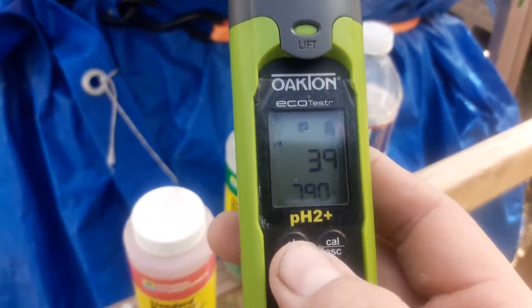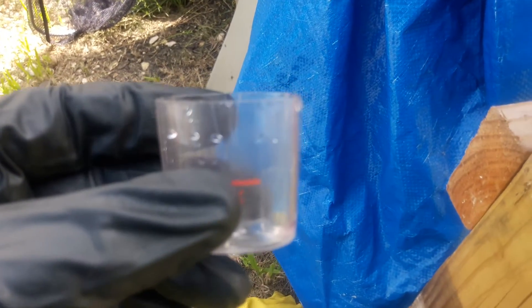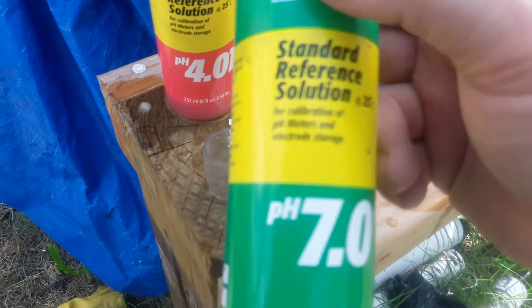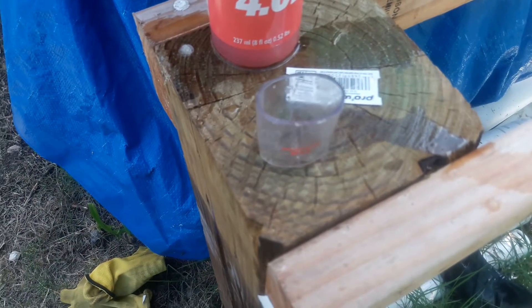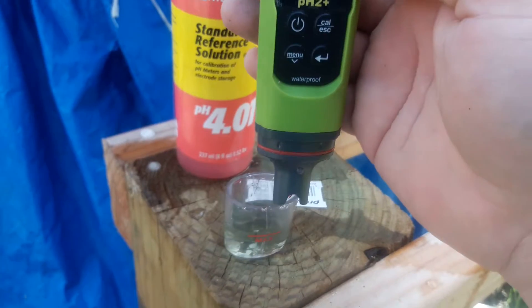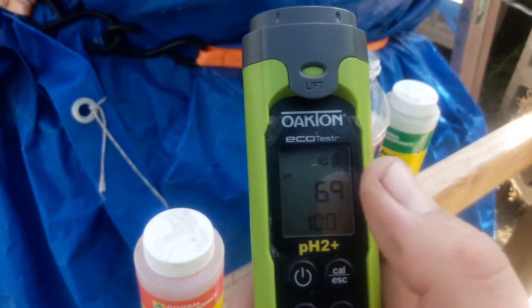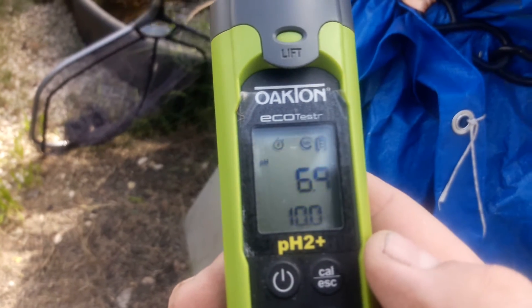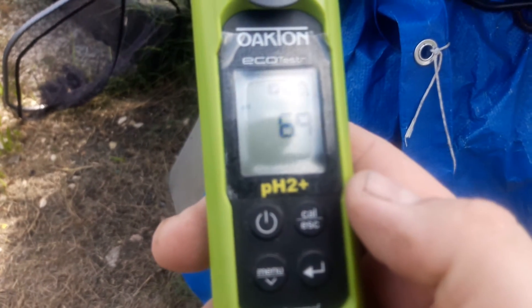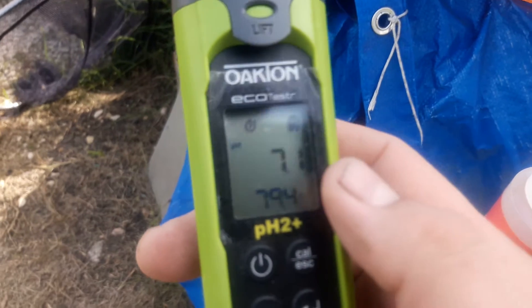For the next calibration point, dump out your testing solution and rinse the probe — distilled water is preferable. Now we'll calibrate to pH 7. Fill it up to the line, stick it in the liquid, and hit the calibrate button. You can see the clock ticking as it processes. It's done — the liquid is calibrating at 6.9 and it's 70 degrees. It finishes reading 7.1 and is calibrated and ready to go.